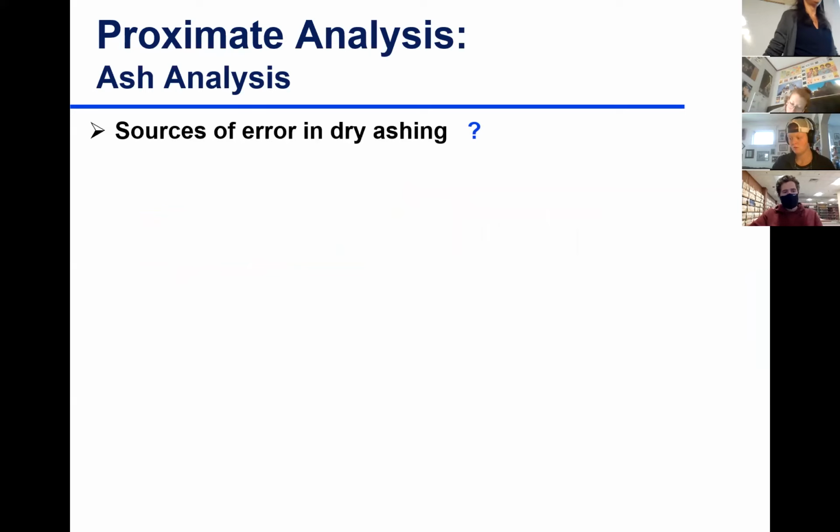So sources of error, from everything we talked about, what do you think sources of error in dry ashing could be? We talked about a few already. Yes, Don?